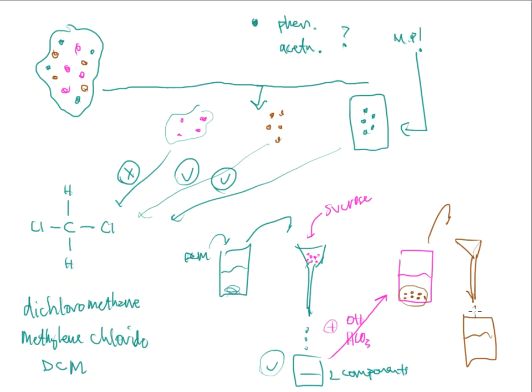And I've got my liquid down here at the bottom, and then that solid is going to be up here at the top. And this is the aspirin. I'll do the same thing. I'll let it dry. When it dries, I'll do a weight. I'll use that weight, compare it to the starting weight of the entire thing from the very beginning, and calculate a percentage. I've now separated my second component.